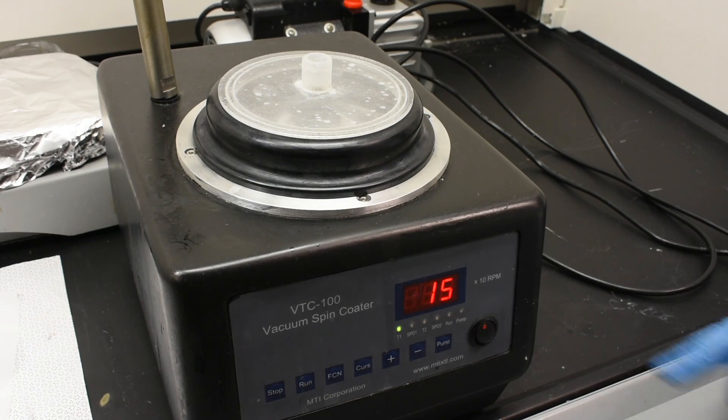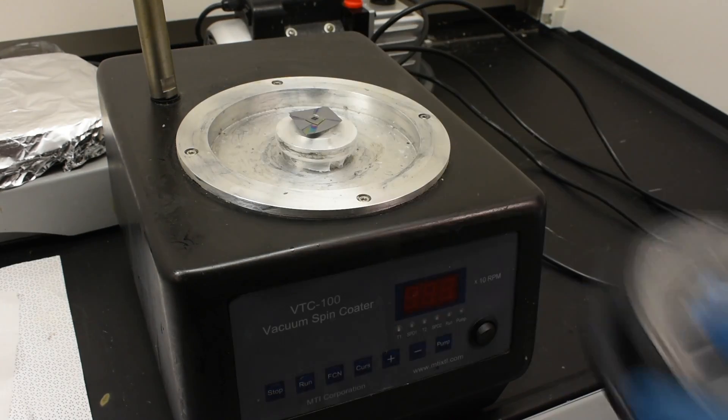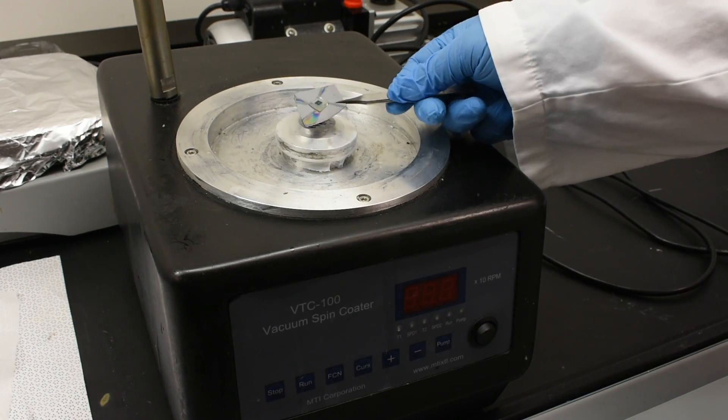The sample is removed from the spin coater and allowed to dry overnight, typically 12 to 18 hours.